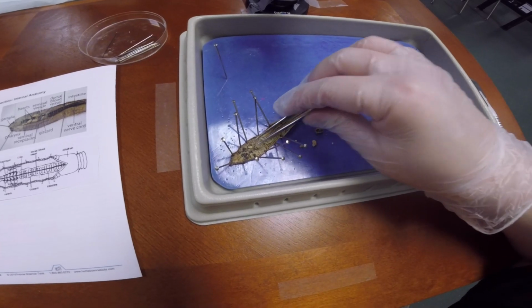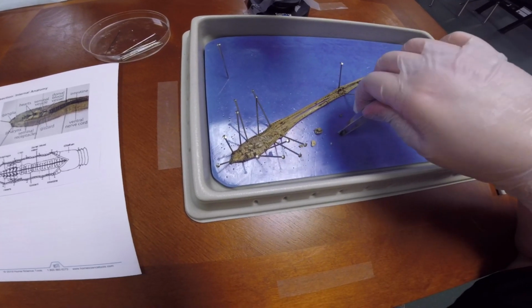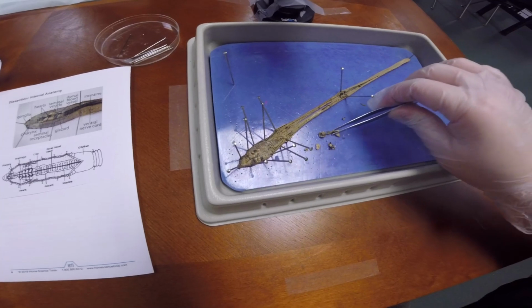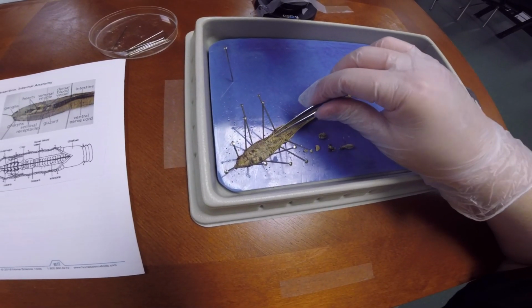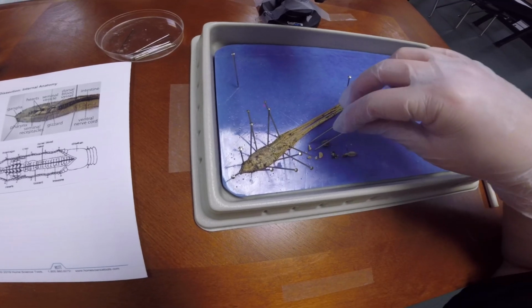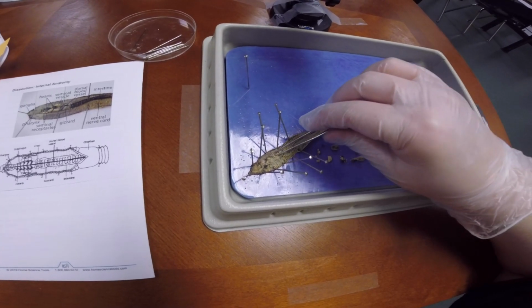Look at that. You can look around up here, see the hearts. You can pull, maybe it's meant to stay in there. Okay, and just look around like that, see what you can see. There's the parts of the hearts, excuse me.